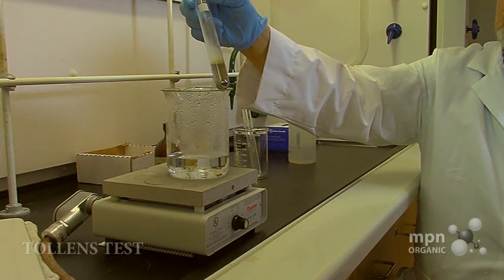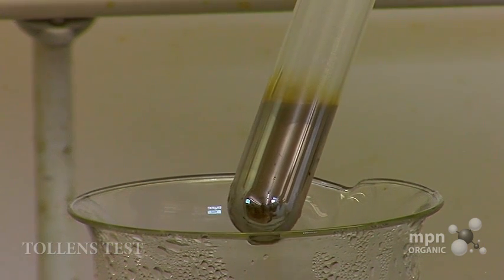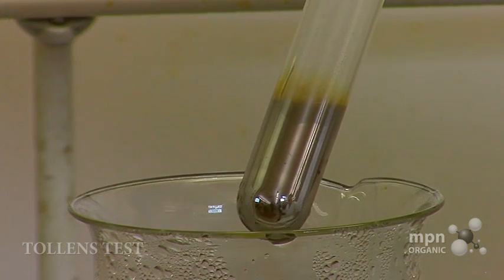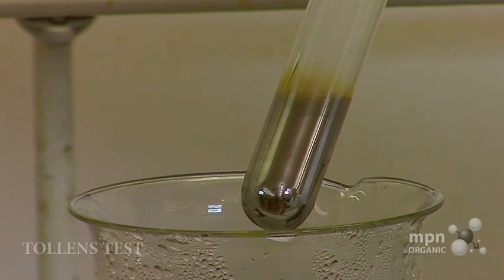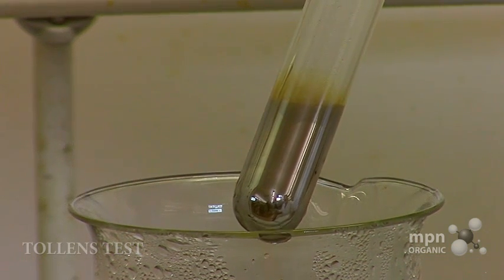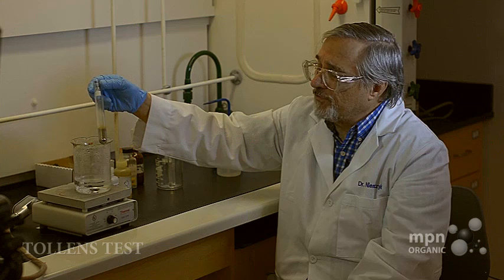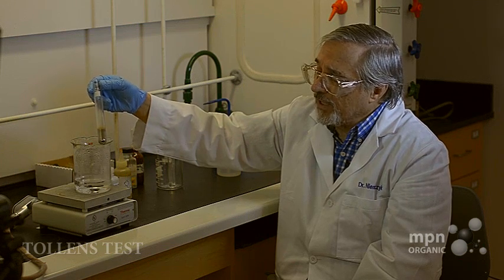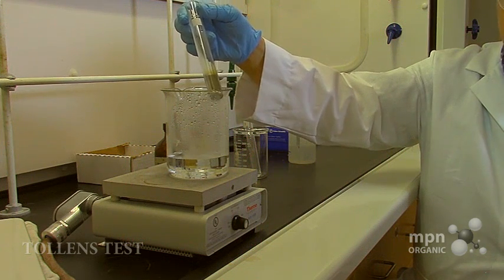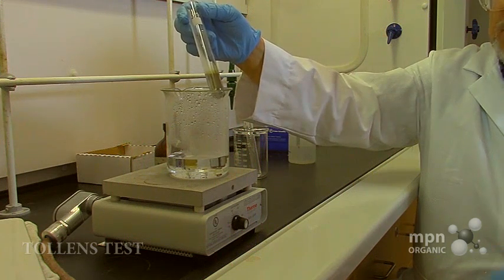This is called the silver mirror test. And it's due to the fact that you have a very easily reducible silver ion in that complex form with ammonia, and you have a very easily oxidizable functional group, namely the aldehyde, supplied by the glucose. So, easily reducible, easily oxidizable.